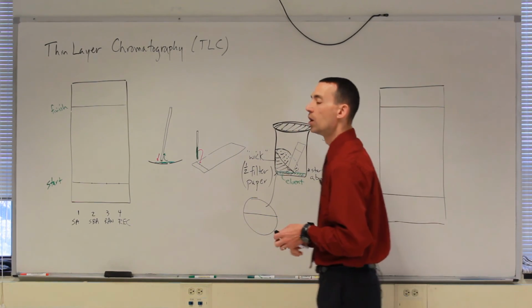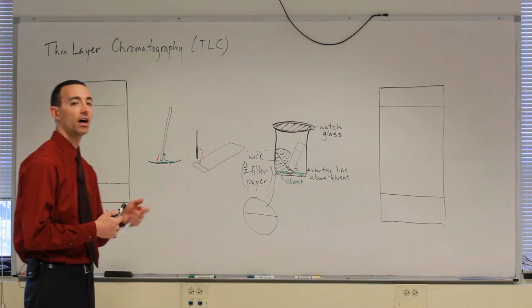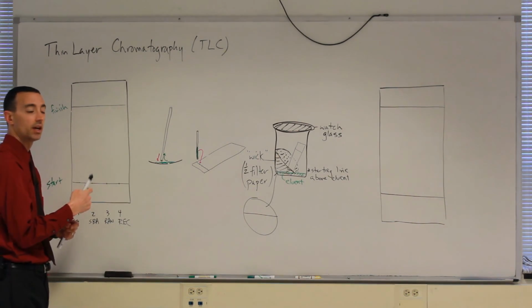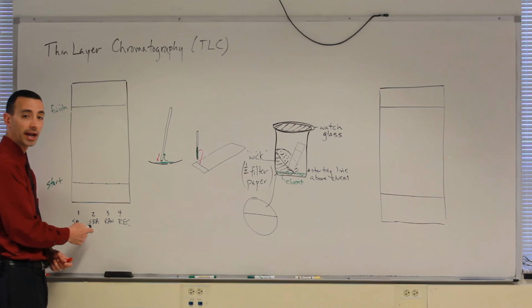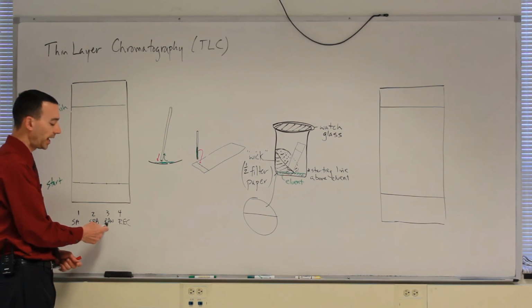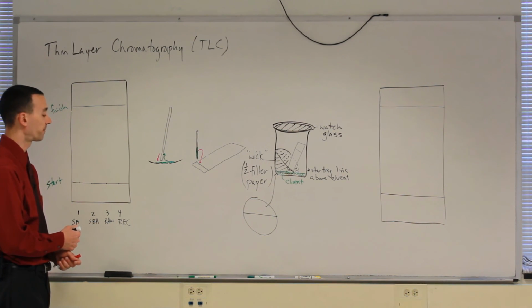So usually we run a comparison side by side of different chemicals that we're interested in. So on our TLC plate, we have 4 chemicals of interest today. We have pure salicylic acid. We have store-bought aspirin, again as our control for comparison. We have the raw aspirin that we made, and then the recrystallized form of our aspirin.